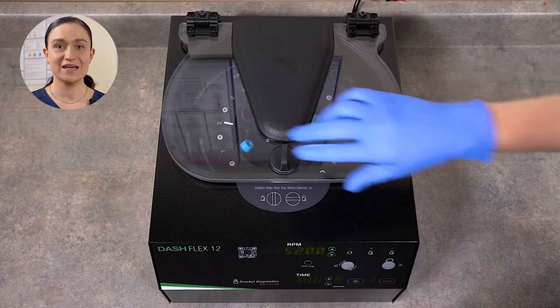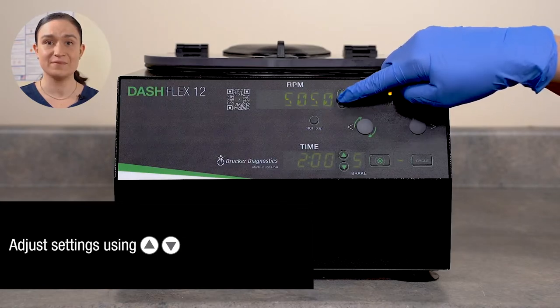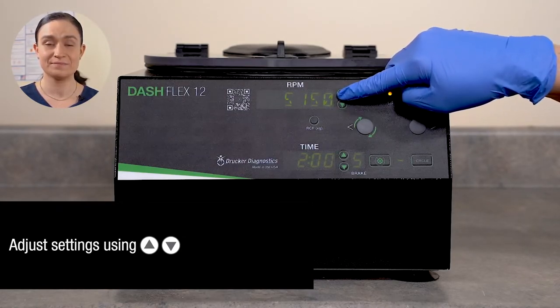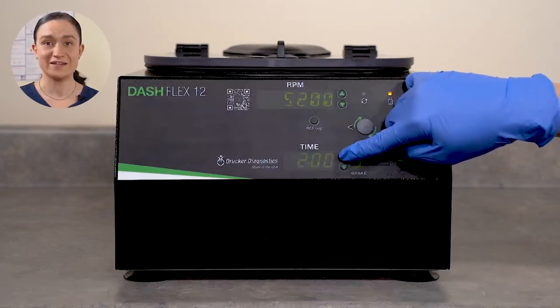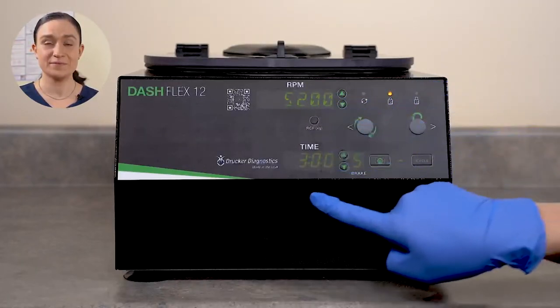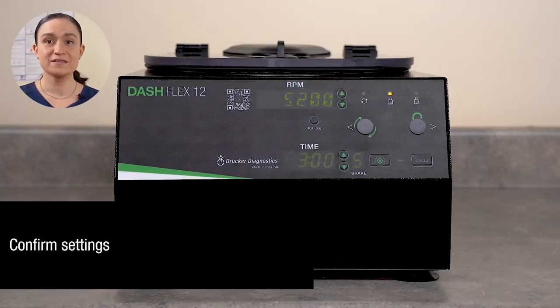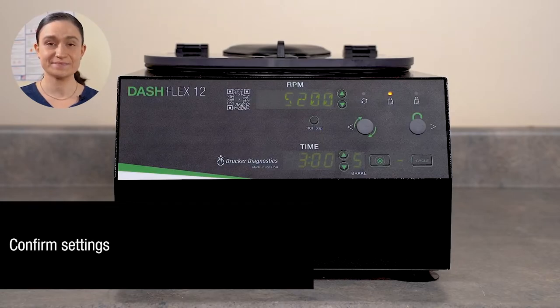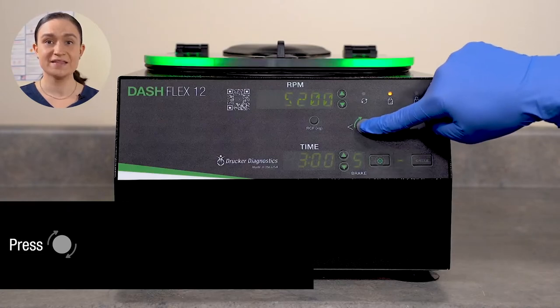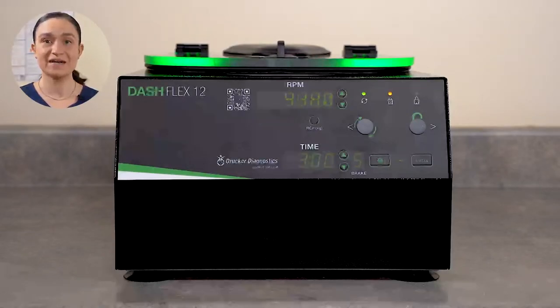With your samples properly balanced, you are now ready to close the lid and spin. Next, adjust your settings. You can adjust RPM and time using the arrow buttons next to the display windows. In our case, we're going to run 5,200 RPM for three minutes, but you can run whatever settings you like. Once you're done programming, double-check your settings, then press the Start button. The centrifuge will automatically lock and the rotor will begin to spin, accelerating until it reaches your selected RPM. It will then run for your chosen time — you can see time remaining on the time screen.